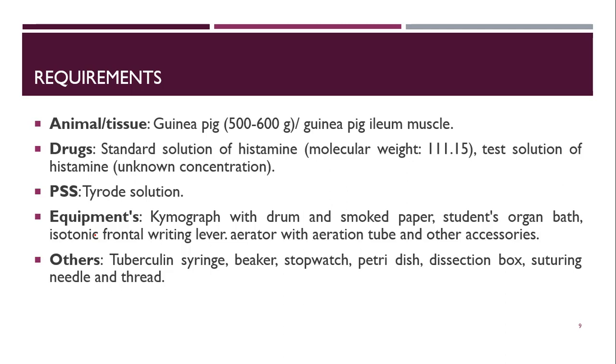The drugs which we have to use are the standard solution of histamine, whose molecular weight is 111.15, and the test solution of histamine, whose concentration is unknown, and the PSS that we are going to use is Tyrode solution. The equipment we have to use are a kymograph with drum and smoked paper, a student's organ bath, an isotonic frontal writing lever, an aerator with aeration tube, and some other accessories.